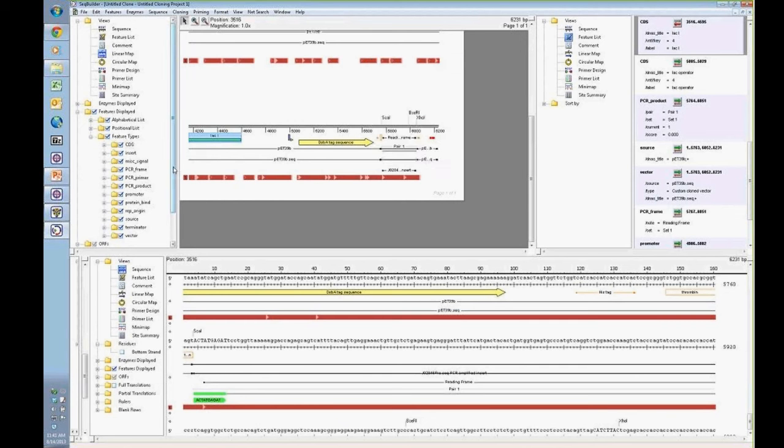If you want to make this your default layout change, so you can manipulate these, change the coloring styles based on whatever you prefer, you would simply go to the View pull-down, and then I can save that layout as my default template. So moving forward, any color changes or visualization changes that you make here, that's going to be retained in this project as well as every project that you work with moving forward.